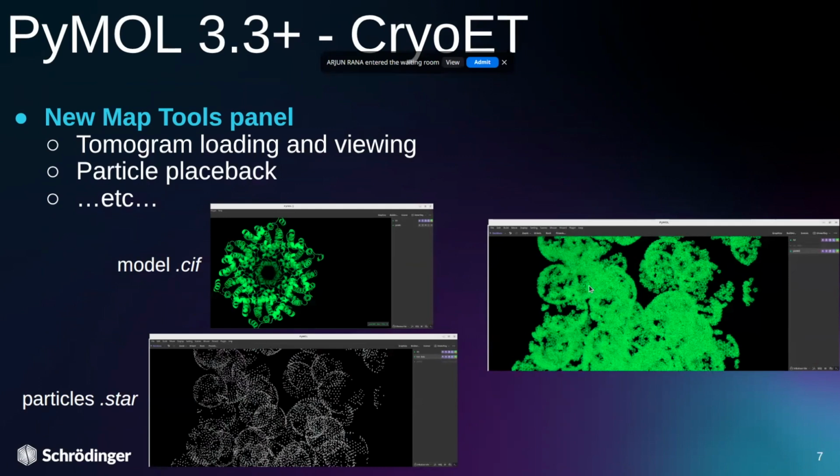And just briefly to touch on the growth of CryoET and if PyMOL has any sort of answer to CryoET. This field is still developing, but before we jump too much into CryoET, we want to make sure that we have a good foundation of visualization for CryoEM first. But I believe CryoET is really a good test case to showcase how powerful Vulkan can be.